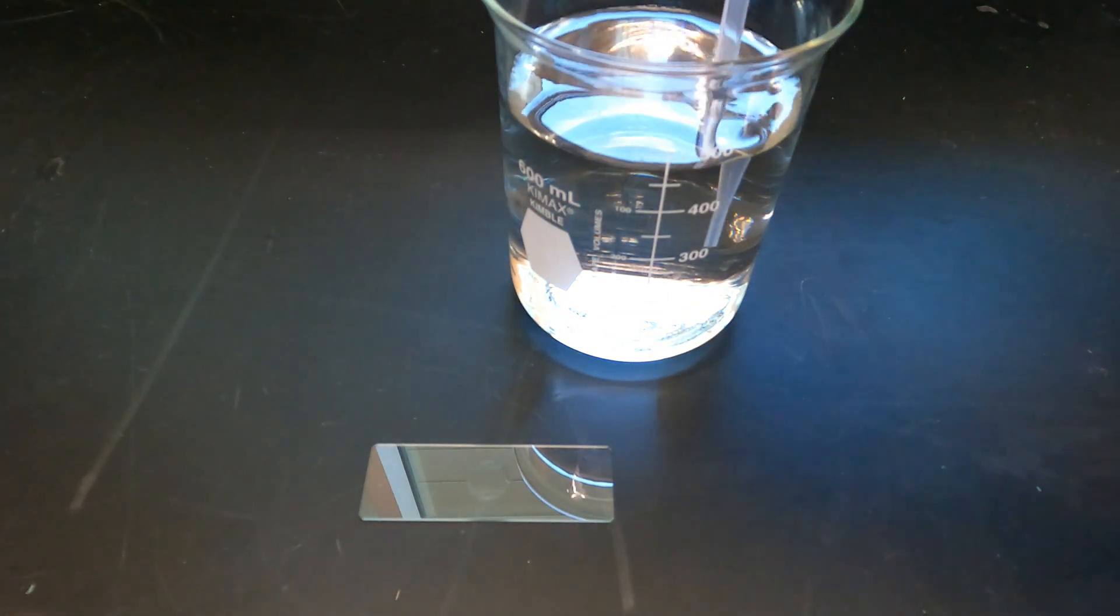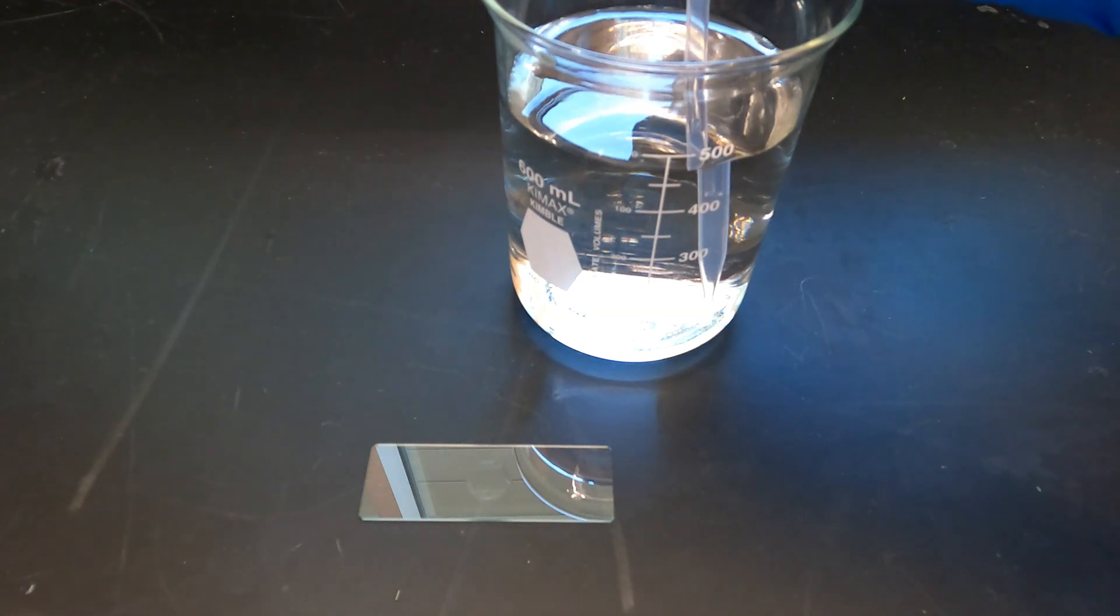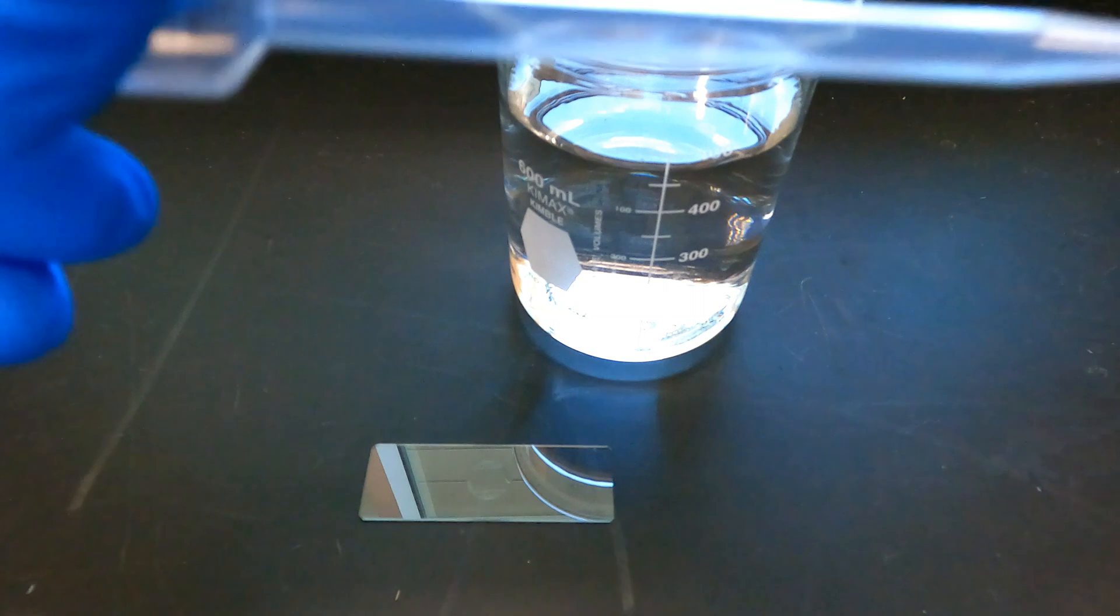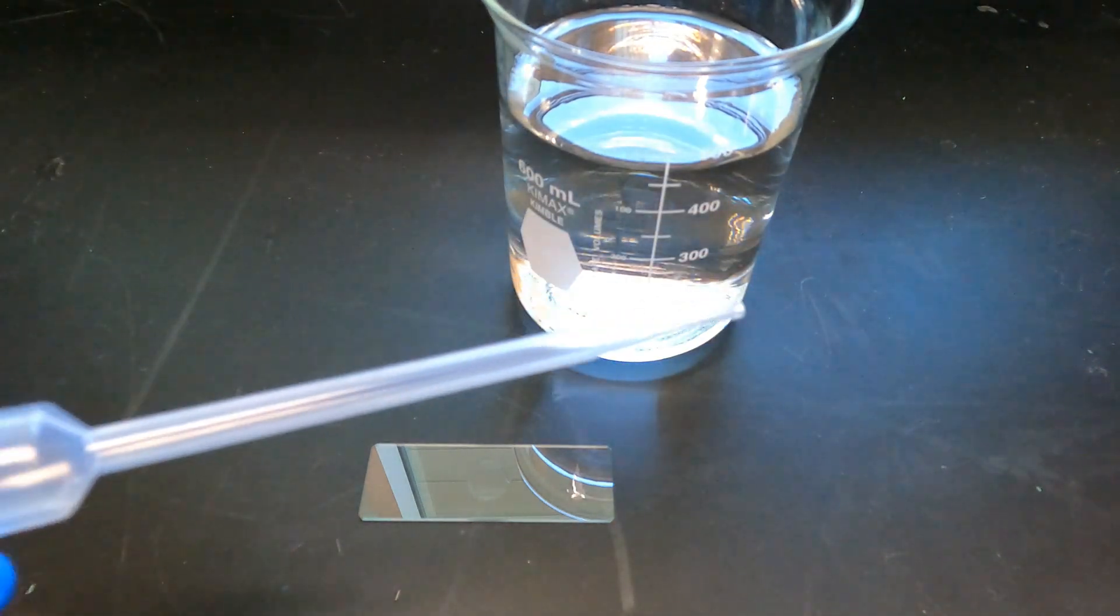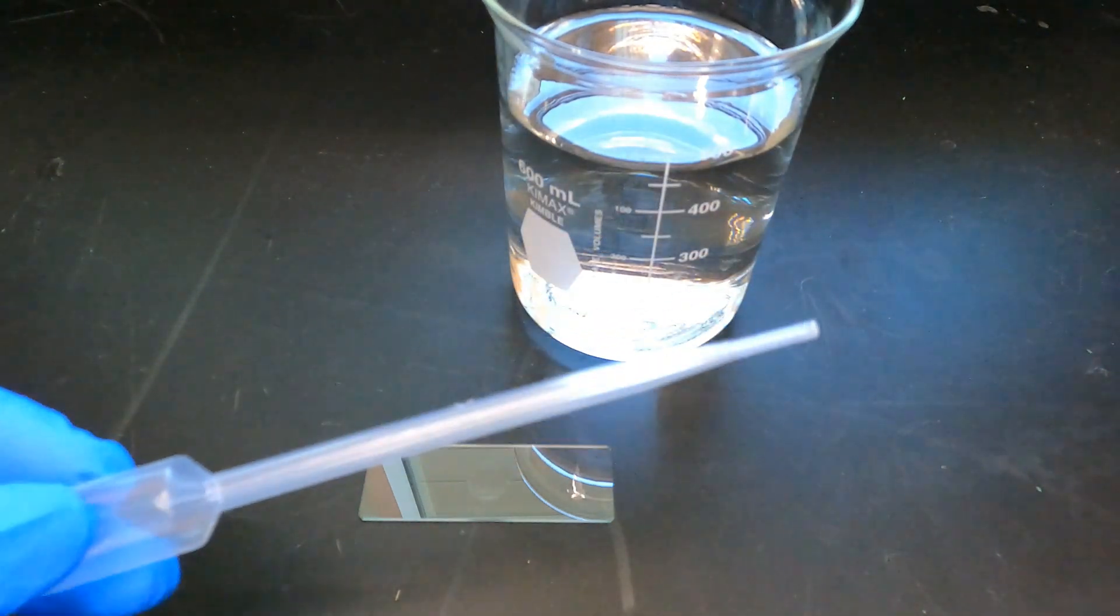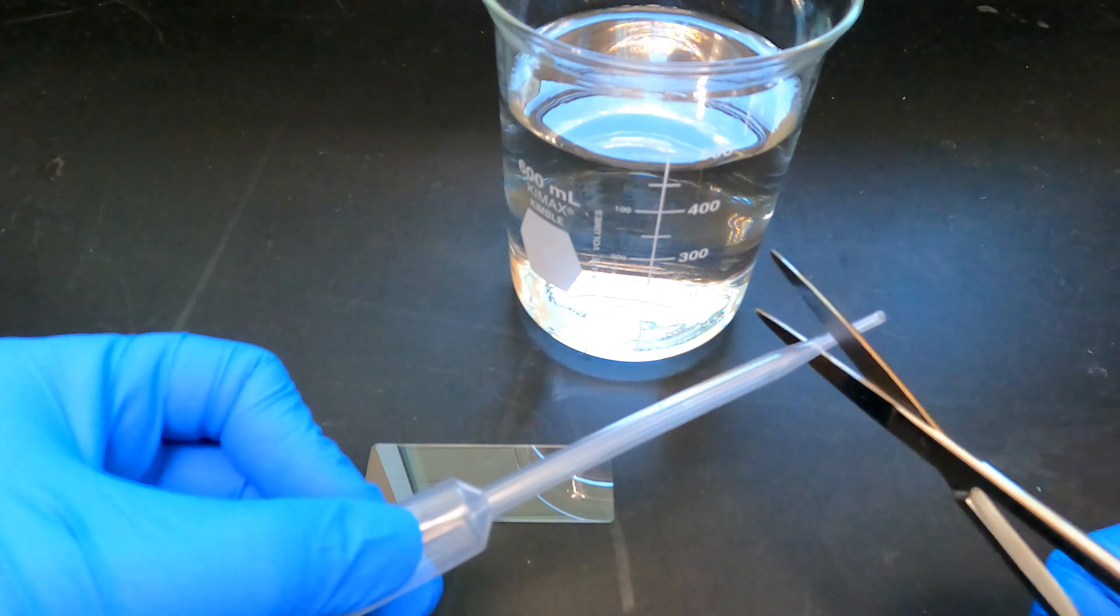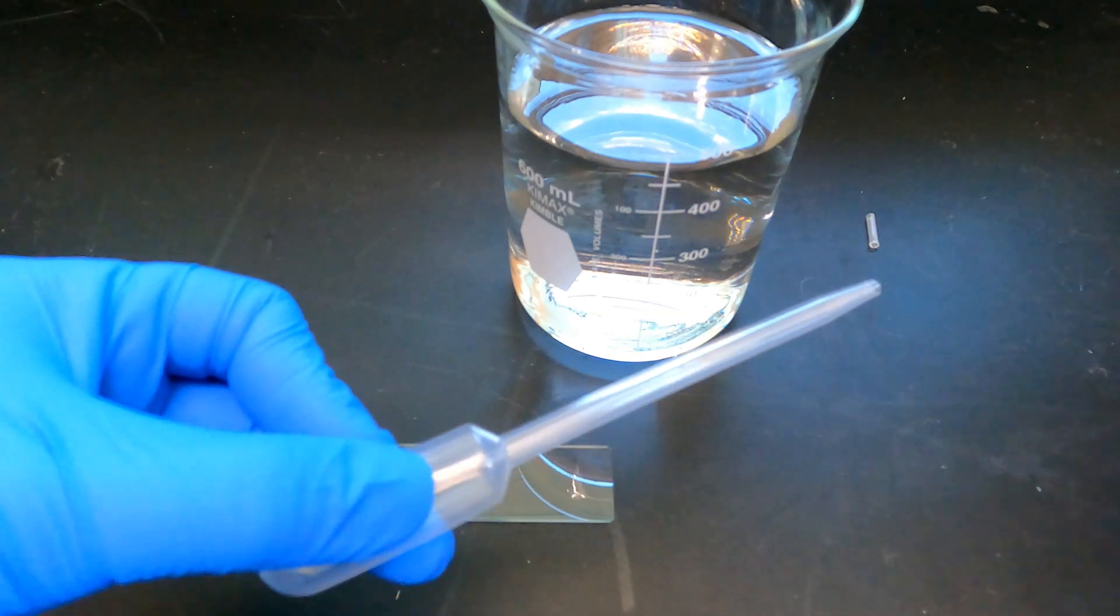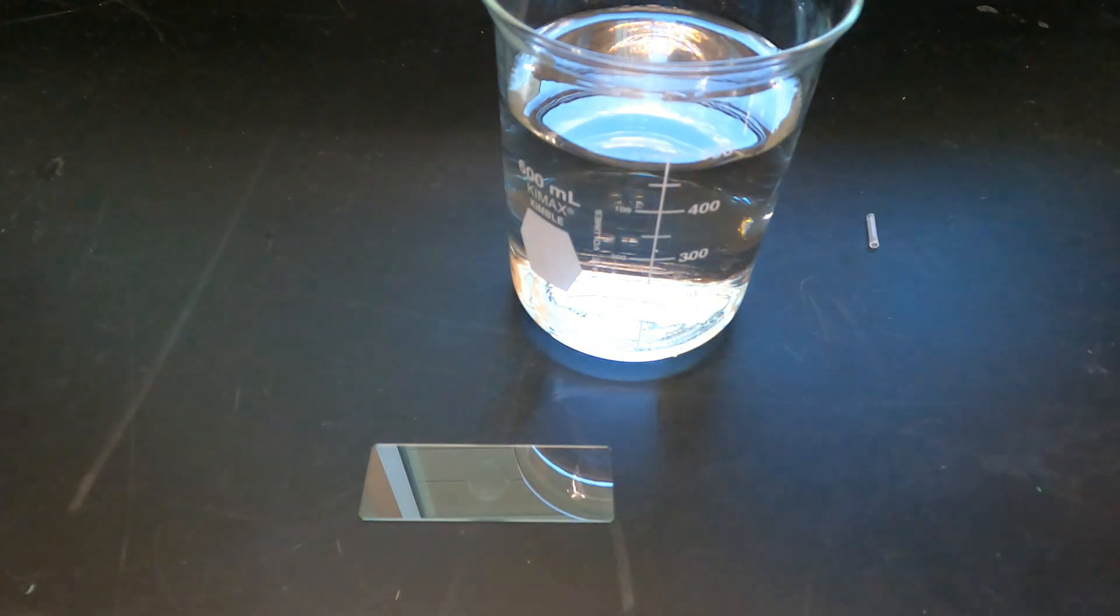Next, you will use a dropper or transfer pipette to capture a single Daphnia from its container. Some Daphnia may be larger than the hole at the end of the transfer pipette. If this is the case, be sure to use a pair of scissors to trim the end of the pipette up to where the diameter of the hole is larger so as to accommodate the body of Daphnia without damaging it.